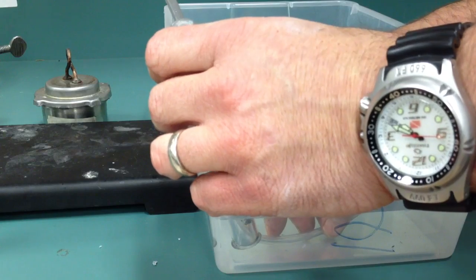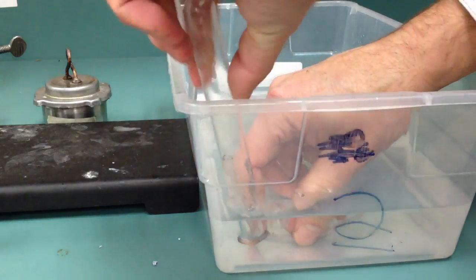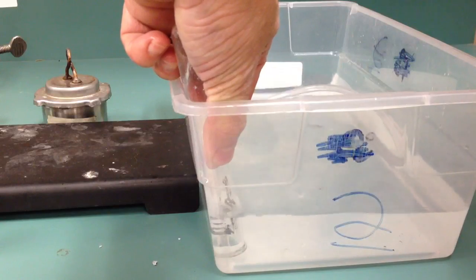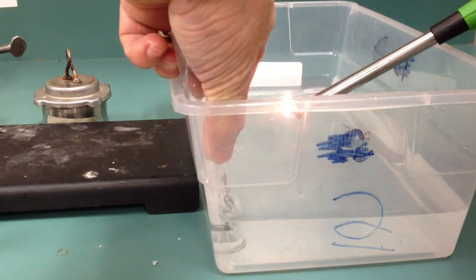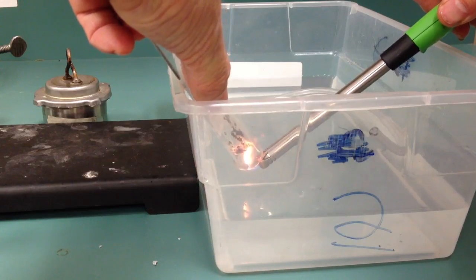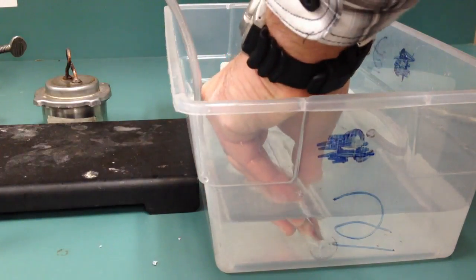And we can get a small pop out of that. So, I'm going to move this out of the way. I'm going to light this flame, see if we can get it to blow up. No luck. Let's try again.